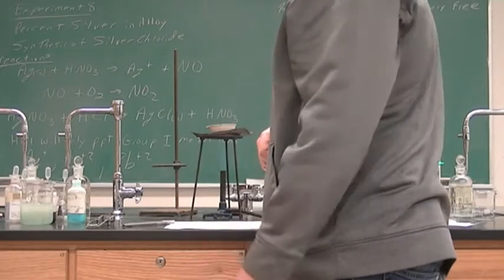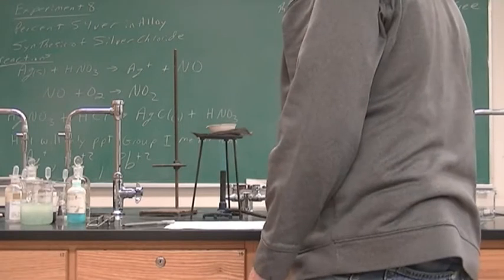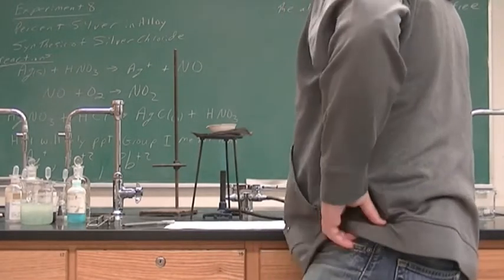Not very exciting, I would show you. It's just water boiling with silver on the bottom of this thing, so nothing exciting happening, just boiling water.